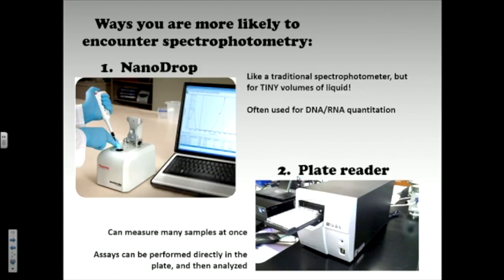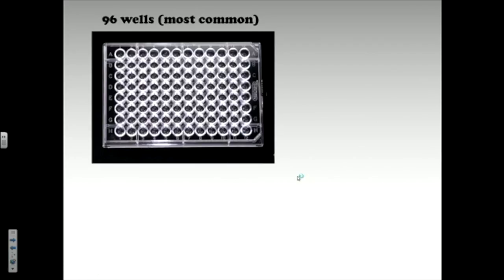But I kind of want to do an aside about the plate reader because, especially since nobody's used them, there are many, many different ways you can use them, many different types of plates, many different types of plate readers. So if you ever find yourself using one of these and never used one before, it can be good to go in kind of knowing what you're doing. So just like a little aside about plates.